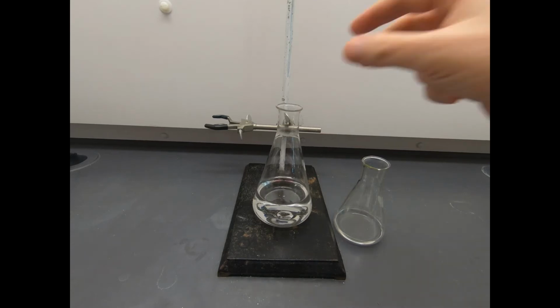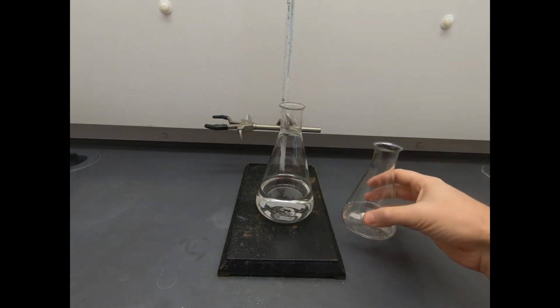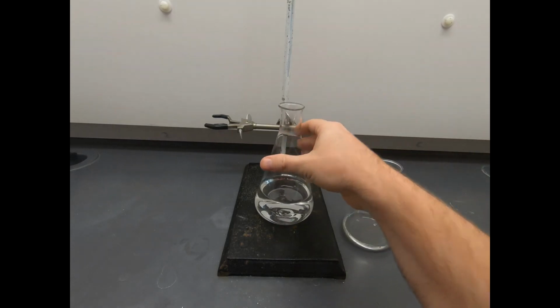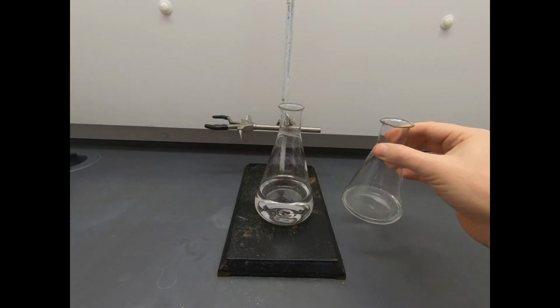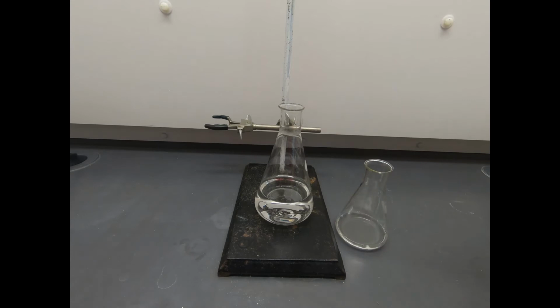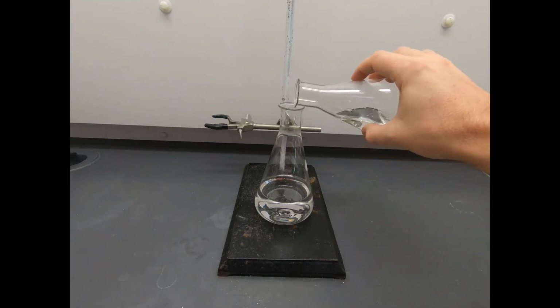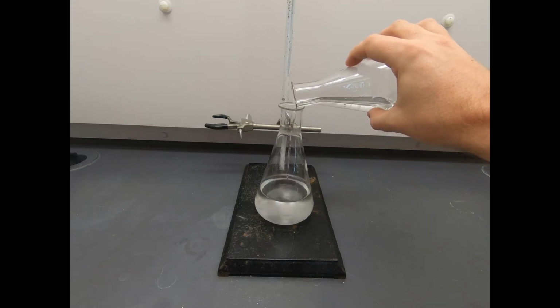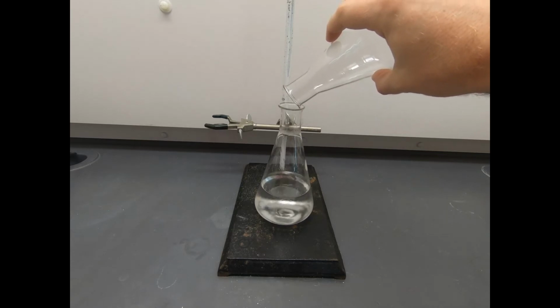It has a nice low pH, so that will make sure that we have the protonated form of our carboxylic acid. Now this isn't just concentrated, so you think, oh, a little bit of acid is good, why not have a lot of acid? Well, the structure of aspirin also includes an ester, and we don't want to risk hydrolyzing that ester. We just want this to be acidic enough to make sure that our carboxylic acid is in its acid form, not its conjugate base carboxylate form. So let's go ahead and swirl this around, and we are going to add this to our water and acid.